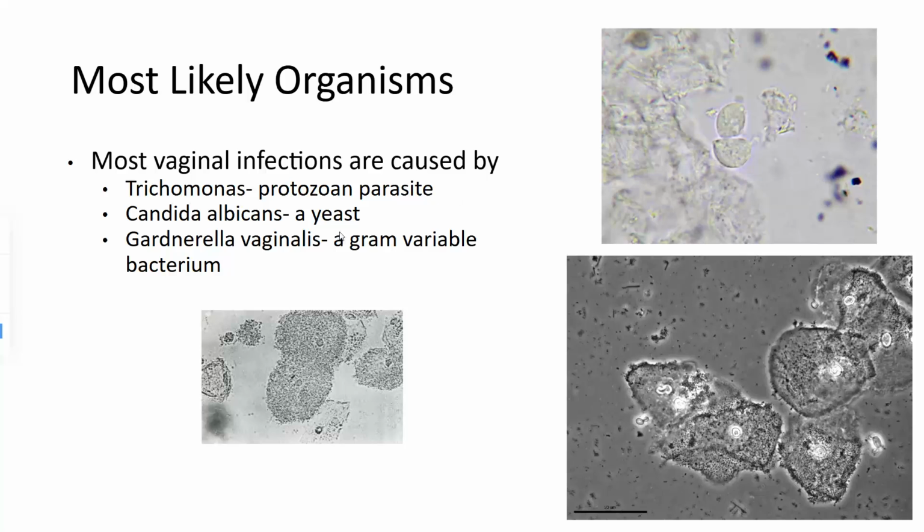Candida albicans causes vaginal yeast infections. So in a Candida albicans specimen, sometimes you'll see budding yeast. Like here you can see these are epithelial cells. And then around the epithelial cells, you can see this right here is a yeast cell and it's budding. Here's like a baby budding yeast on it. So you can see around here are various yeast cells.